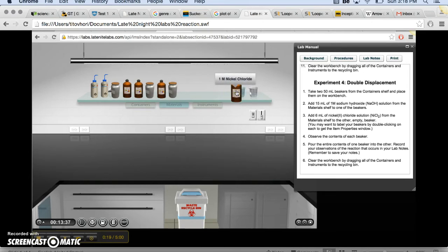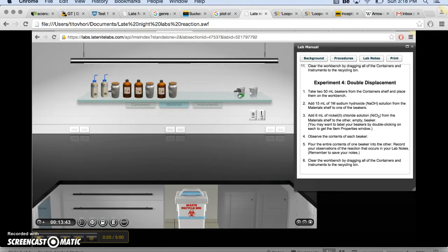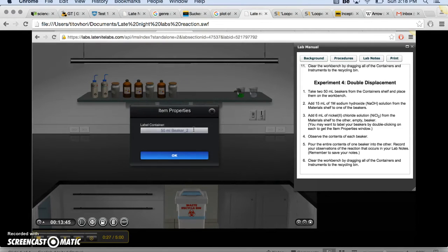Then we're going to take our one molar nickel chloride and place six milliliters of it in our second 50 milliliter glass beaker. Once we do this, we're going to go ahead and properly label our beakers.